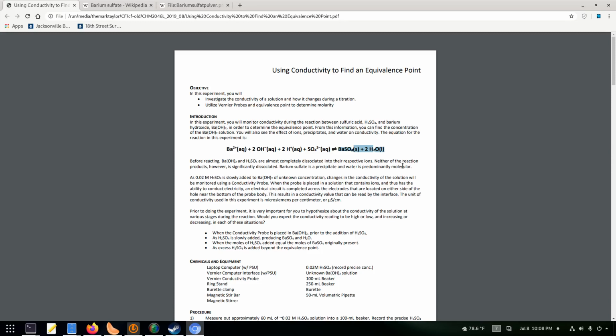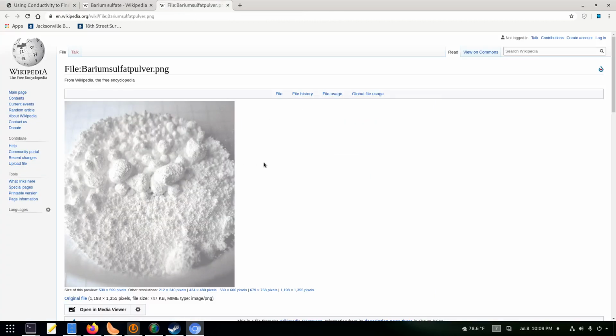This would be an interesting procedure. As we titrate, we'd see a white powder build up in there, and it would start forming almost right away. And our endpoint would be when that white powder stops forming. Well, if you think about that, that's going to be pretty impossible to actually observe, because you're looking for a point where suddenly it looks less cloudy. So we don't even bother to try that.